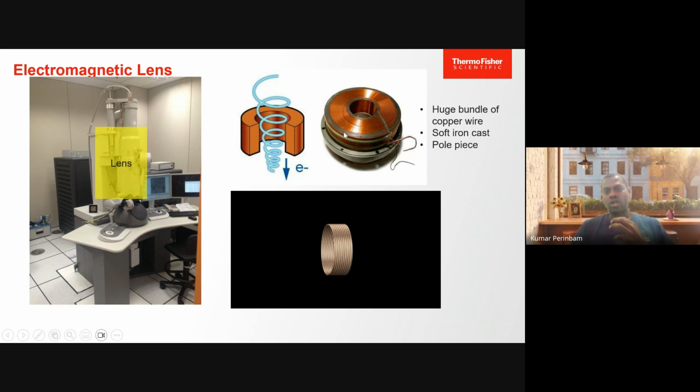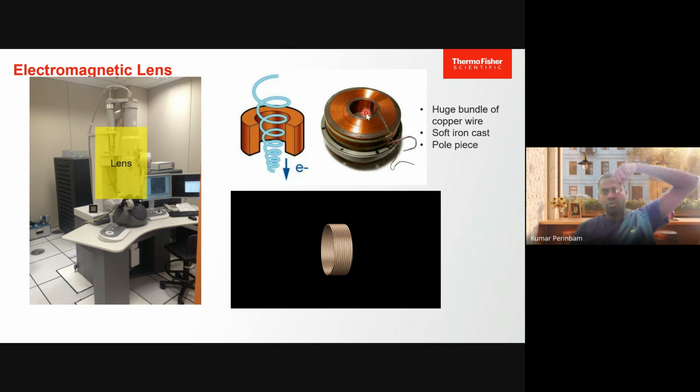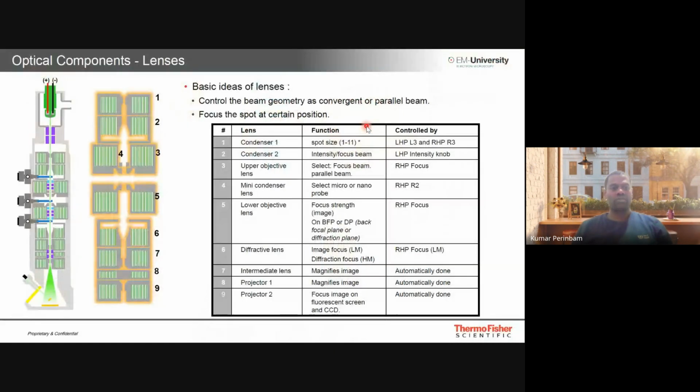So there's going to be a coil of copper through the hole. Right next to the hole, you're going to insert the sharp edge of the tungsten. You're going to give a very mild current on it, and once the edge is inserted in the hole over here, on the point where the sharp edge is, the electrons are pulled, and it's going to create a very coherent electron beam.